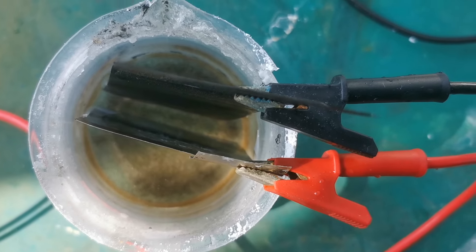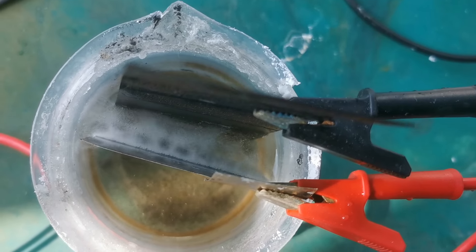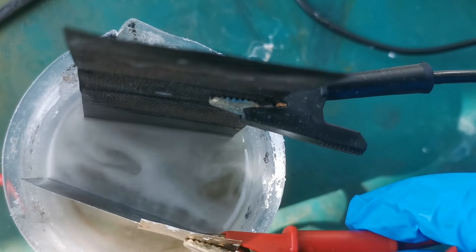Hi guys, here is M.I.H. My lab has a decent collection of metal electrodes such as stainless steel, copper, titanium, and lead. However, I missed out one of the most commonly used electromaterials, nickel.